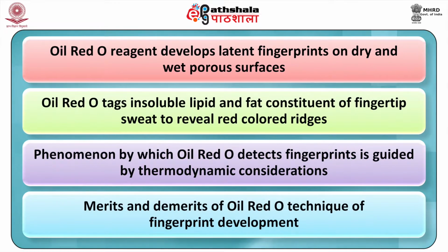Dear students, after studying this module, you shall be able to know that the oil red O reagent develops latent fingerprints on dry and wet porous surfaces. The oil red O tags insoluble lipid and fat constituent of fingertip sweat to reveal red colored ridges.